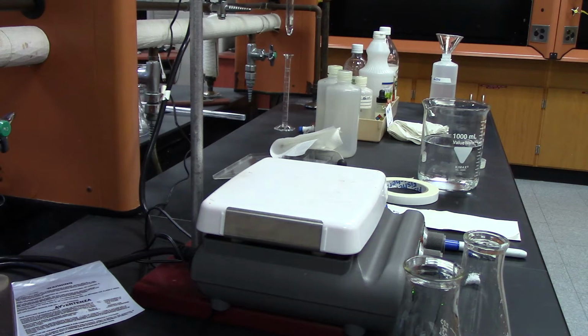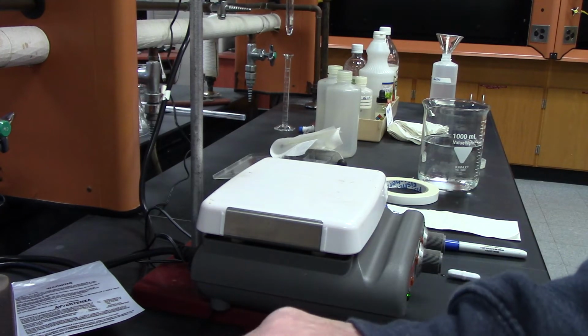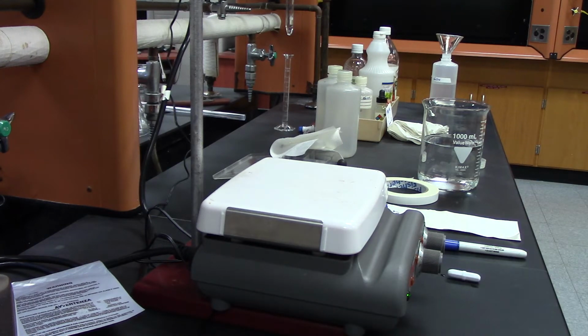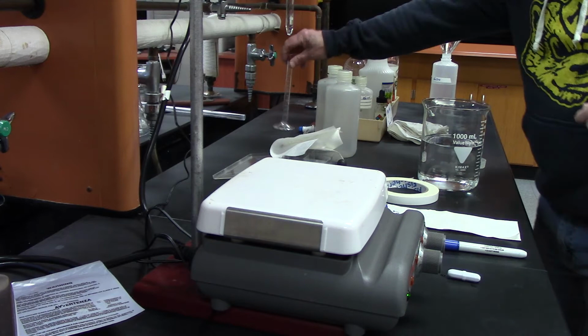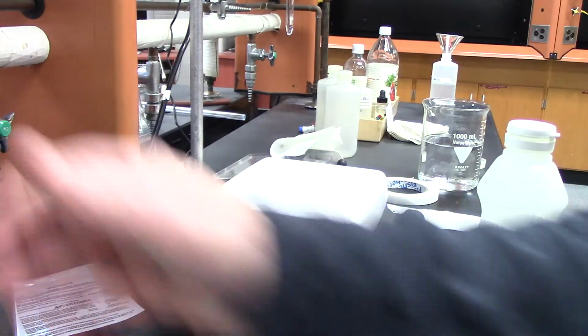So it's going to be a very, very similar reaction. I'm going to add the sodium hydroxide back into the burette. Instead of weighing out 0.4 to 0.5 grams of the KHP, we're going to measure out between 4 and 5 mL of commercial vinegar. And then not worry about the volume, but actually concentrate on its mass. Then do the same kind of experiment.